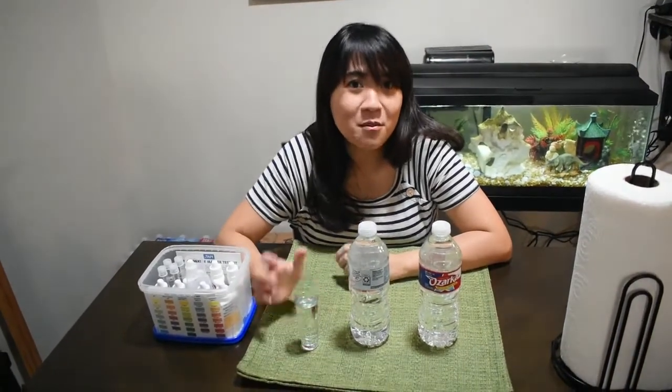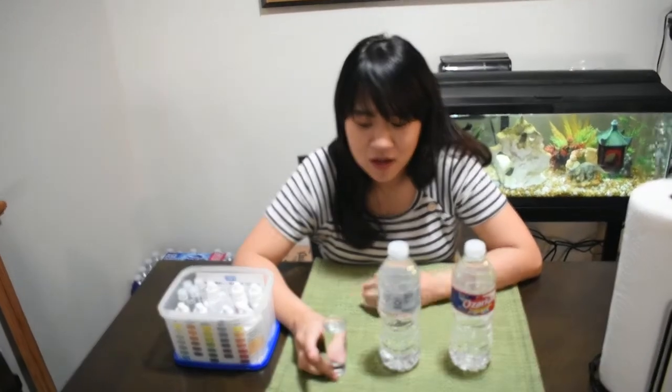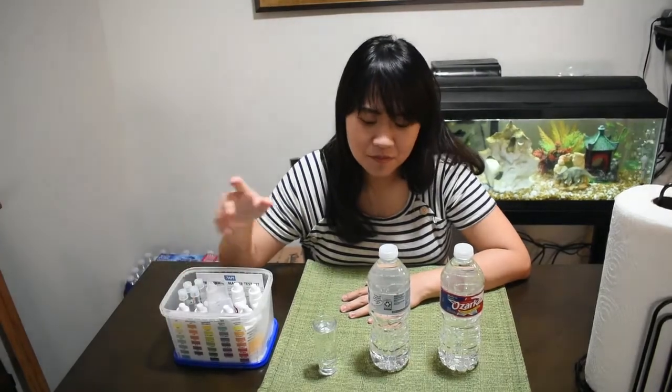And this one is tap water. The tap water in America, usually people drink that all the time. So I just kind of want to know, because sometimes we cook with that and we drink it in every place. I just want to know if this is good or safe or something like that. That's why I want to test with a testing kit.